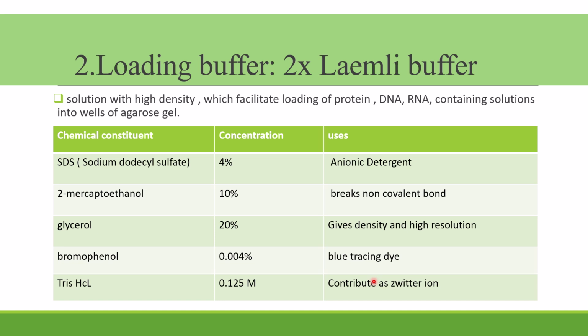You want the protein sample that you load into the wells to be a little dense, right? It should not mix with the other solutions as you pour it, so we want it to be dense to settle at one place. For that we add glycerol.